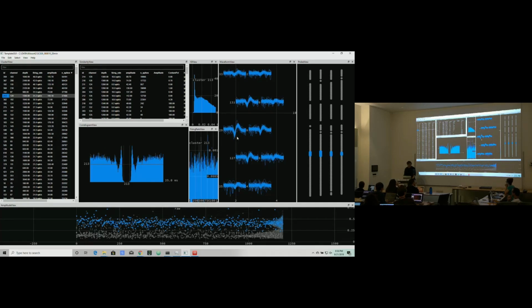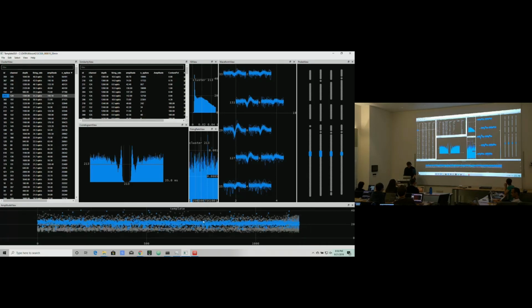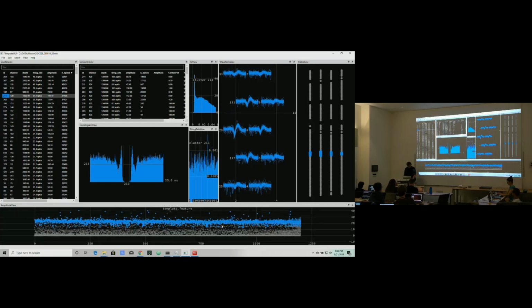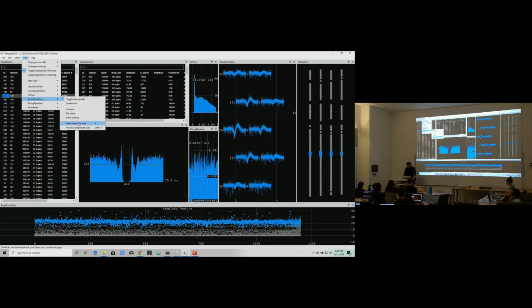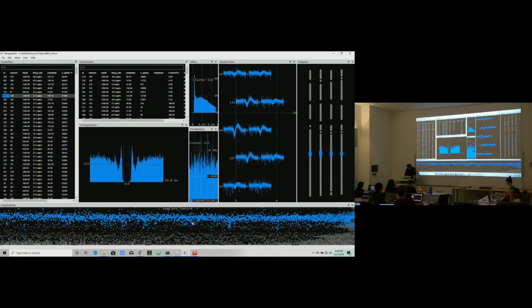All right. Well, we can double check that. Sorry, some of this stuff is new for us too. I'm going to cycle back to what I know. Well, now I'm not sure which one of the 2 it is. This stuff that I know. Hold on. Yeah, they can show the amplitude number. Okay, this one, yeah? Okay, good. All right.